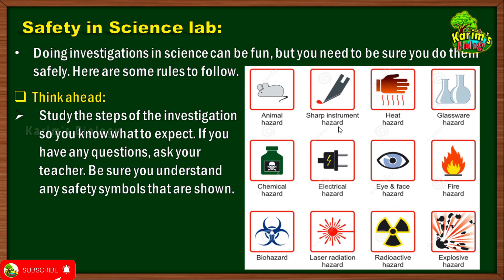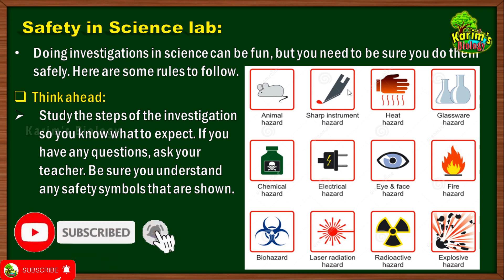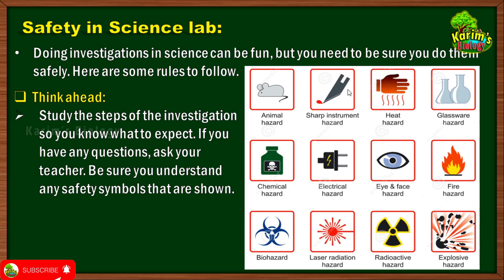The symbol for sharp instrument hazard means you may use instruments such as blades or glass rods in the science lab, and there is a chance you may get injured. So this symbol will be printed on objects you must be careful with. Heat hazard — if any apparatus or chemical can cause hazard in the form of heat, this is the symbol to look for. Glassware hazard means glass items may be broken and cause injuries.